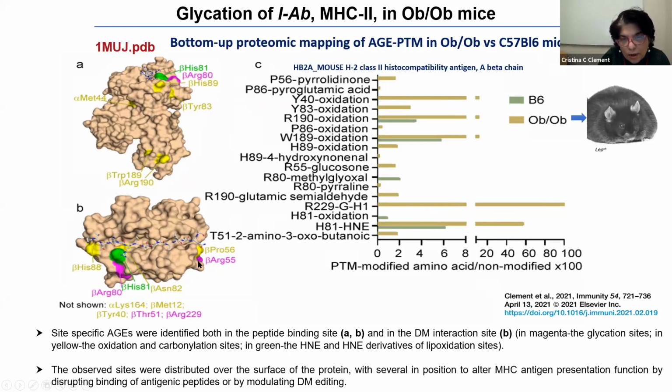What we can do is show total advanced glycation product. There are antibodies, very hard to find them, and you can show the total amount of AGE, but you cannot show specifically for each of these PTMs. This is coming only from mass spectrometry analysis. Is that your question? What's your question?